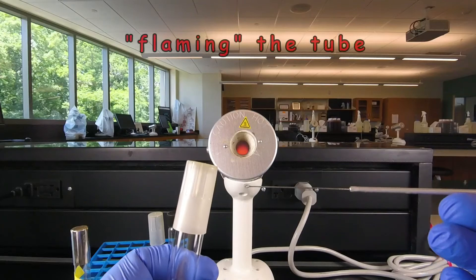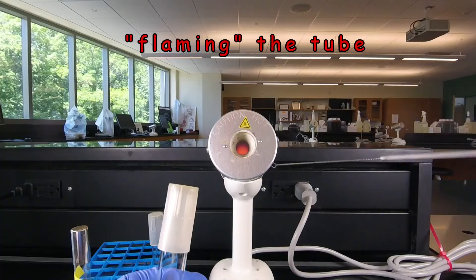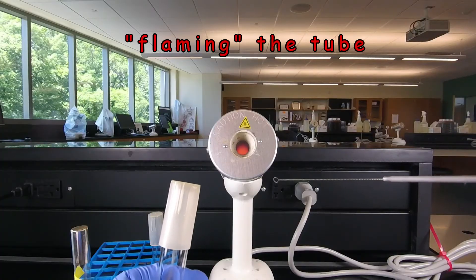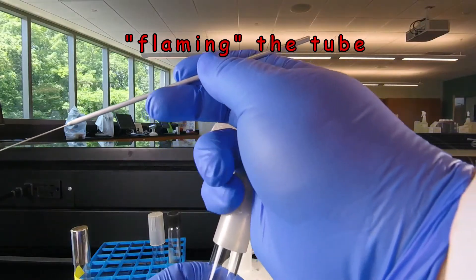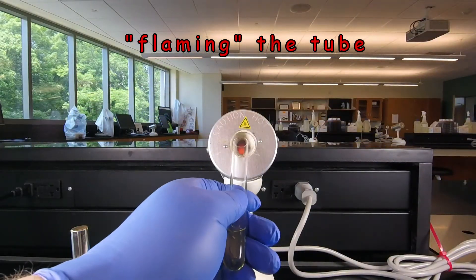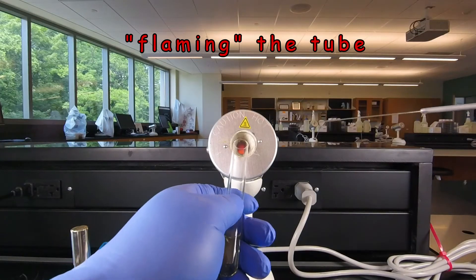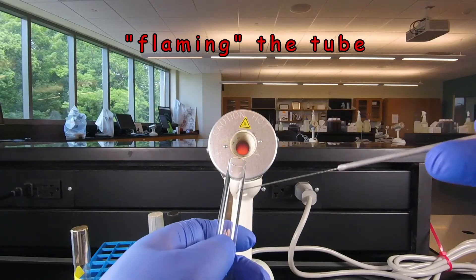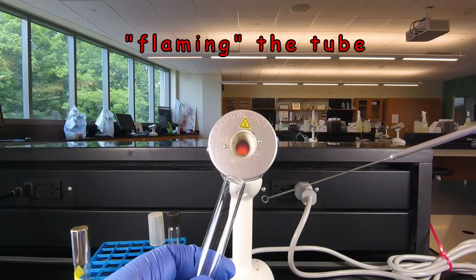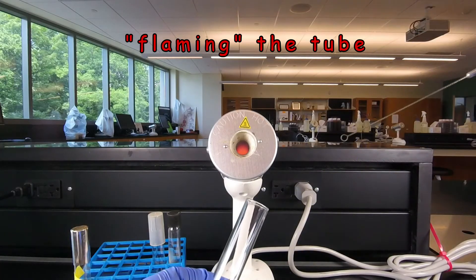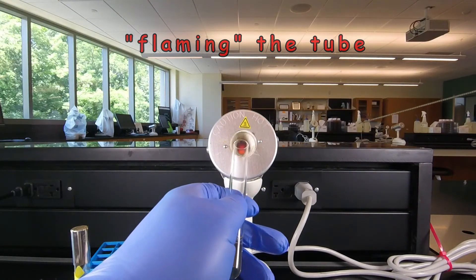Now when we're doing this for real once we remove the cap we do what's called flaming the tube. This goes back to when we used to use Bunsen burners for aseptic technique and we put the tube in a flame. What we do after we remove the cap is put the opening of the tube against the Bacto incinerator and leave it there for three seconds. What that does is temporarily heat the glass in the air, warm air rises and microorganisms can't fall in from the air as easily. Then we take out the bacteria or put in the bacteria or do whatever procedure we're doing. And then before we put the cap on we flame the tube again.